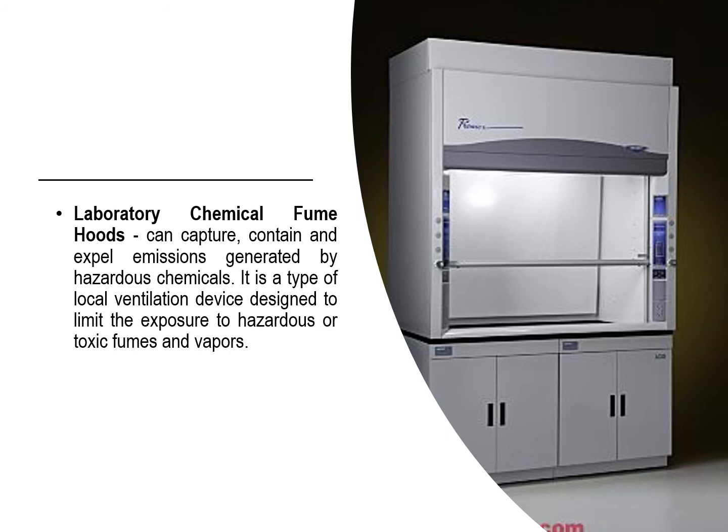Next, we have our laboratory chemical fume hood. It has the ability to capture, contain, and expel emissions generated by hazardous chemicals. We have mentioned earlier that some chemicals have the ability to emit toxic fumes. That's why they must be placed or handled inside the laboratory chemical fume hood.